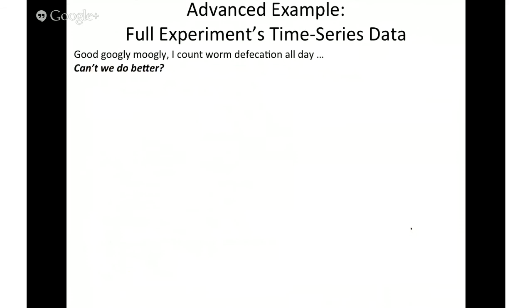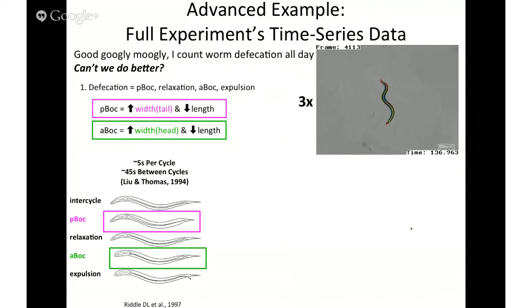And I wanted to show, this is something I did for a particular conference, I did it on the plane ride over, it's defecation. I'll talk to you about defecation right now. And I just want this video to play here. So this is a worm defecating. This is the only video of it defecating.